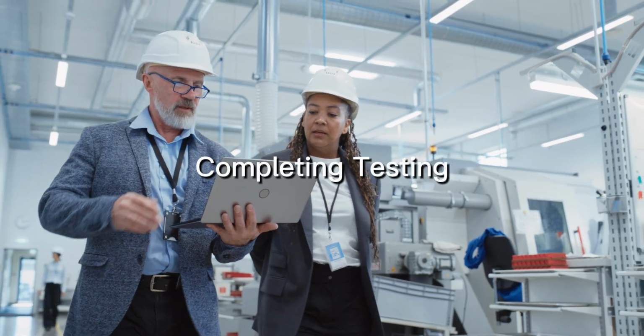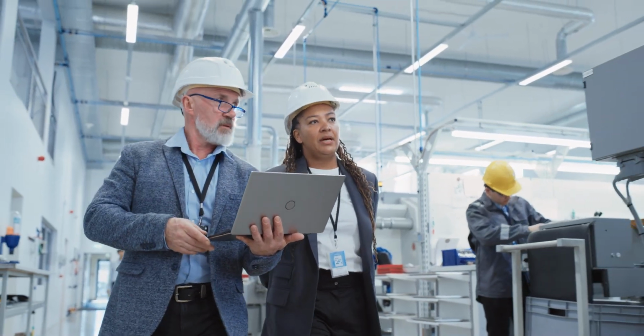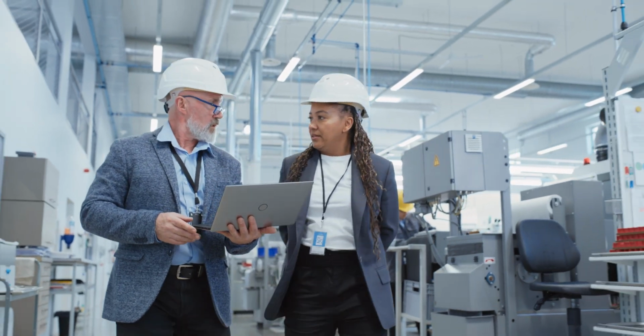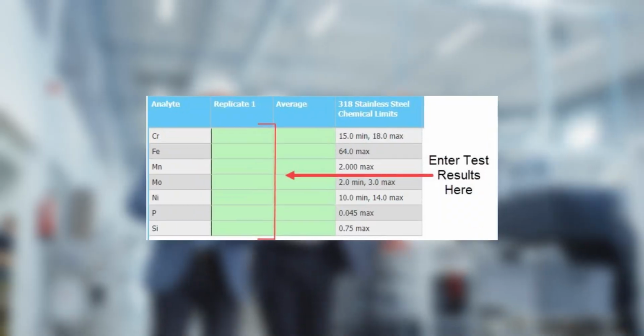Completing testing. Finally, when testing is complete, data from all of the testing on a sample or order is usually combined into a report or an exported file for use outside of LIMS. The capabilities and features of the LIMS provider will determine what can be done with the data.